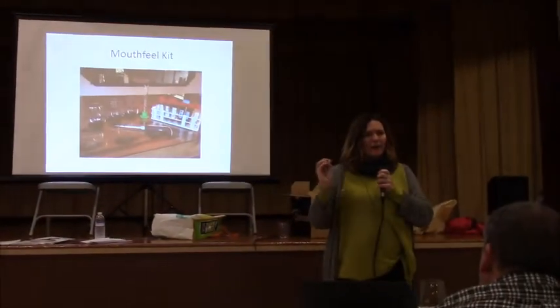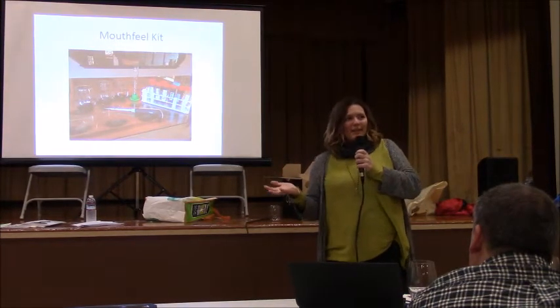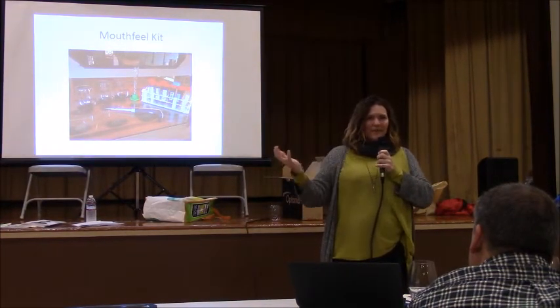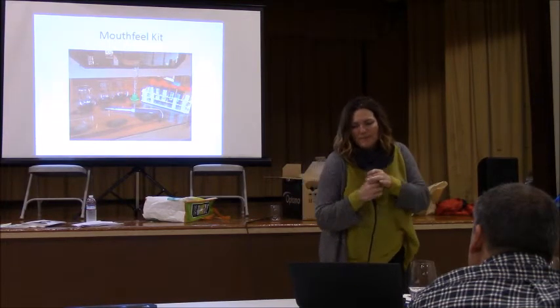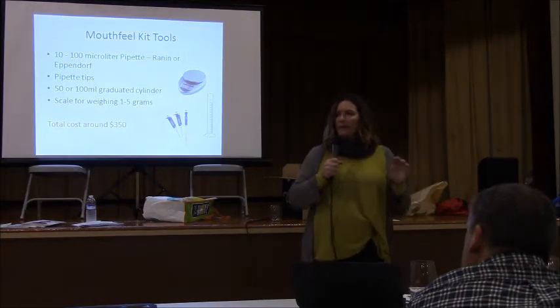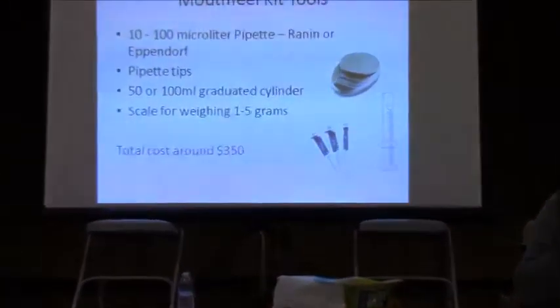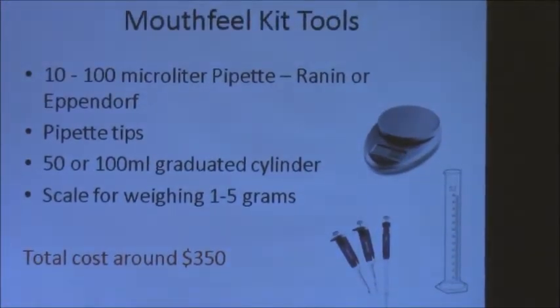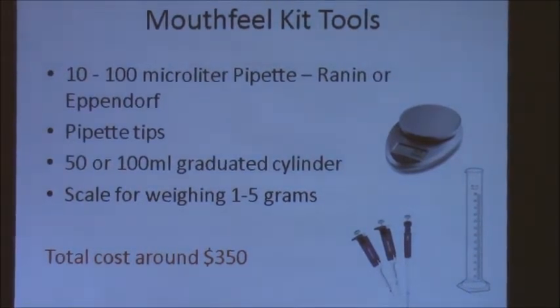If you can take 1 liter and do 10 different trials and work out exactly how you need to tweak your wine to dial it in, because you can't afford that much extra wine at these small volumes. So get some micropipettors, as well as a small scale that can weigh out small volumes, some graduated cylinders, just your basic labware. And if you can use it and share it amongst your group, I think it's very beneficial.